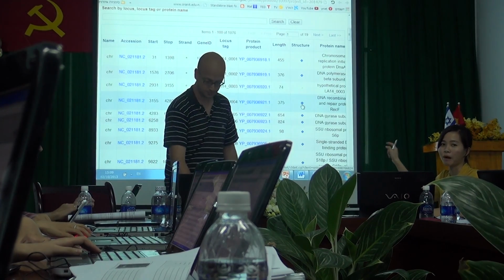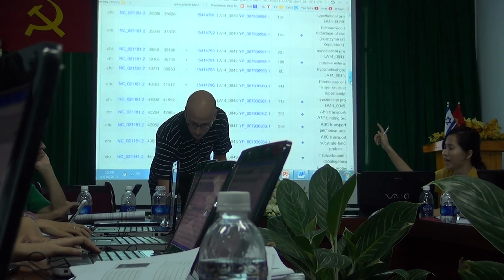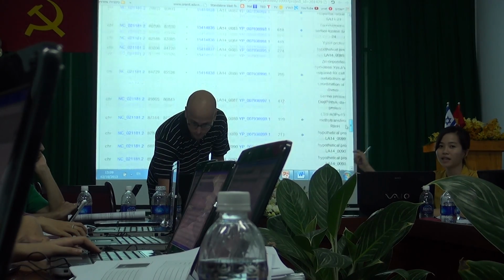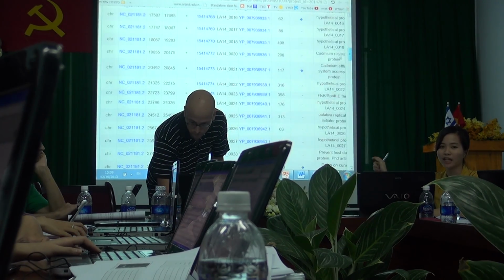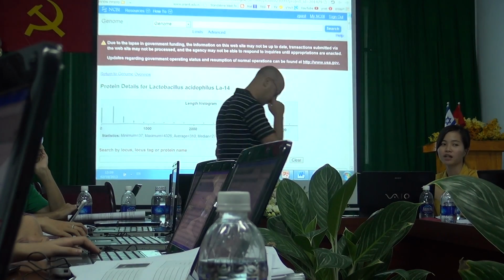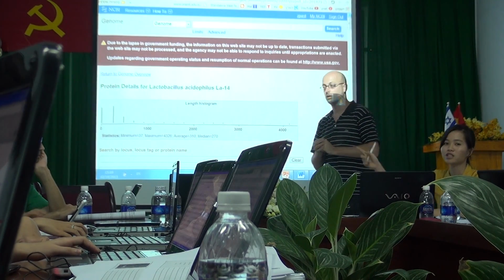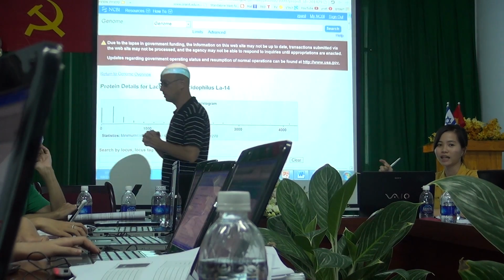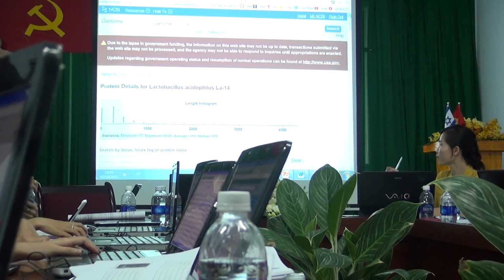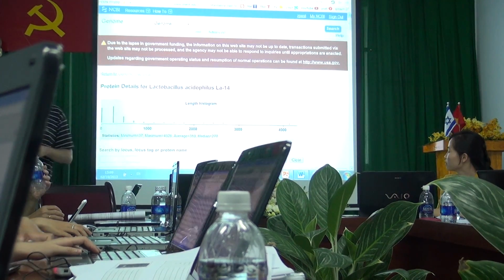Cái hàng ngang là một của một cái protein, và mỗi cái hàng dọc là một cái mục. Như ví dụ cái hàng đầu tiên, cái bên cùng đó là cái chromosome. Cái bên đó là cái thông số truy cập của protein. Nếu mình quan tâm tới cái loại protein đó thì mình nhấn vô, nó sẽ đưa mình qua cái trang về cái protein đó trong cái cơ sở dữ liệu protein. Và cái tiếp theo, cái string mà có dấu cộng á, thì nó có thể là cái protein nằm trong cái chuỗi gốc, trong cái mạch nó. Và cái bên nữa thì nó là những cái mô tả về cái protein đó, như tên hay gì đó. Okay.